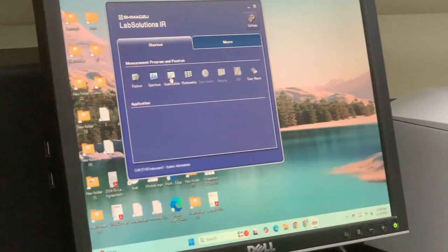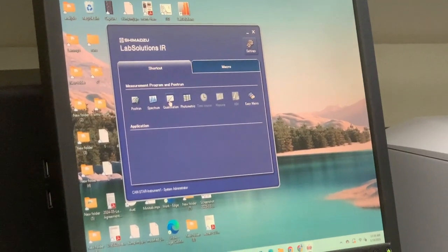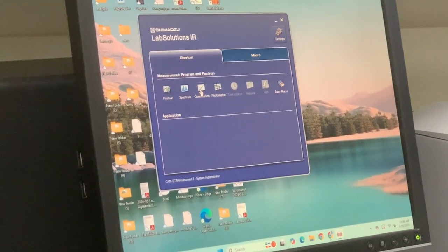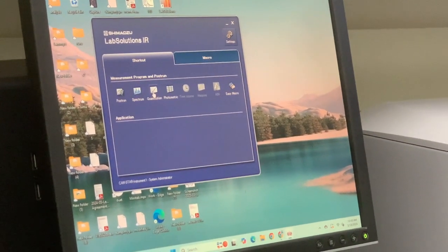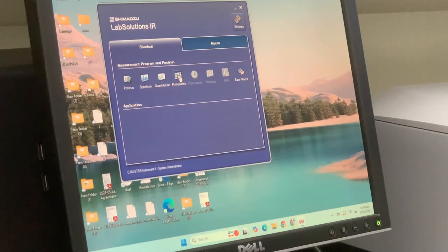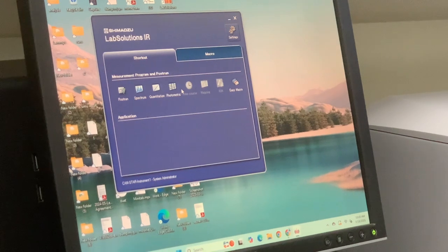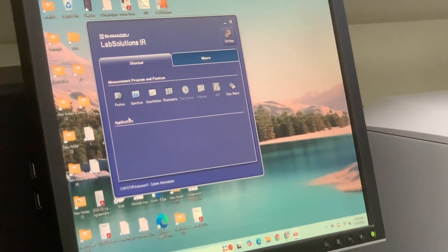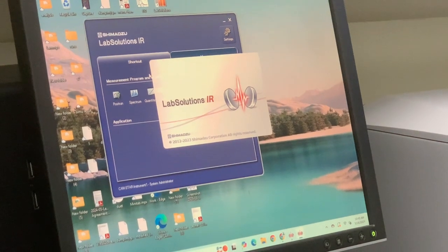Quantitation is if you have standards, and you can make the calibration curve based off of that, and then use those for your samples. So in your case, I'm not sure if this would be applicable with the films, versus if it was just a cuvette or something like that maybe. And then photometric is kind of like spectrum, but you're doing multiple wavelengths, so you get several places to pick from. So let's just start with spectrum. That is the main one, most commonly used.